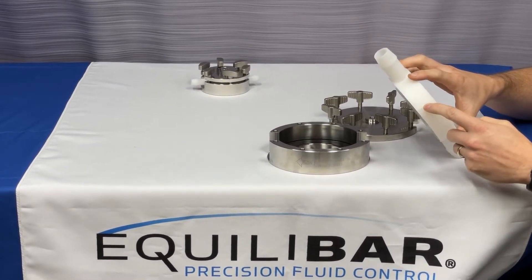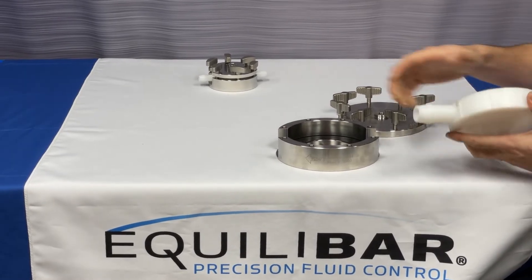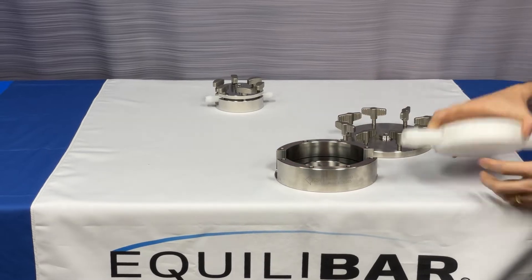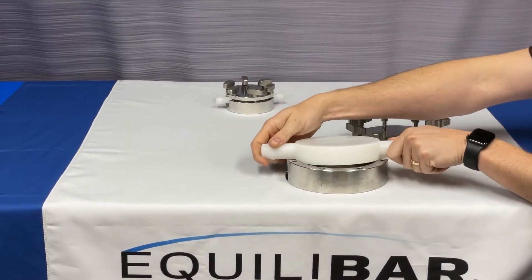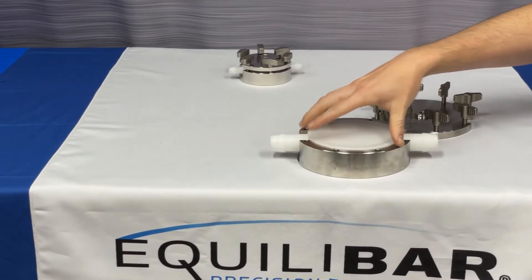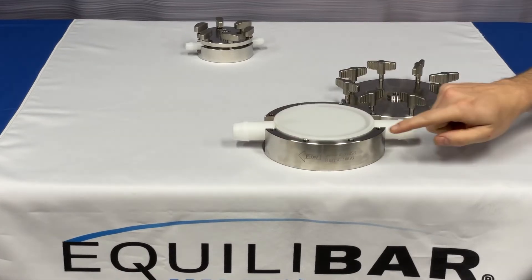Secondly, there's a ribbed keyway feature here on the outer diameter of the valve that fits in a corresponding slot on the cradle. What this will ensure is that no matter the orientation, the Equilibar valve can only be placed in the cradle one way, which is the correct orientation and will align with the flow arrow lasered on the cradle.